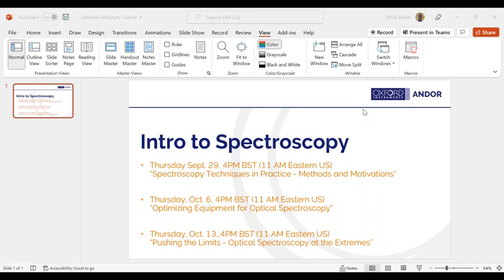So that might be something like atomic emission spectroscopy, if you're trying to determine whether lead is present, or how much additives are in a particular stainless steel formula or something like that. So for sure, we can do spectroscopy on heavy metals, and the exact type would be up to what you're trying to do. Of course, a lot of metal ions absorb in the visible or around. So if you're looking at heavy metal ions, that could be a pretty simple optical absorption measurement that would lend itself to a UV-Vis style measurement, measuring a simple absorption spectra.